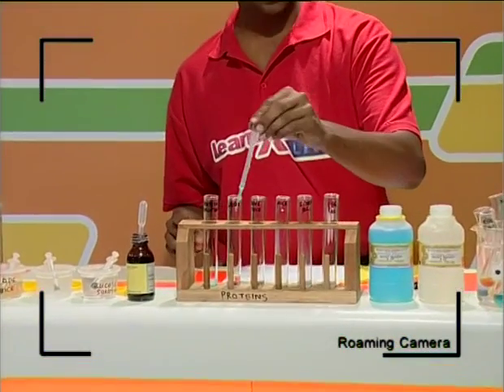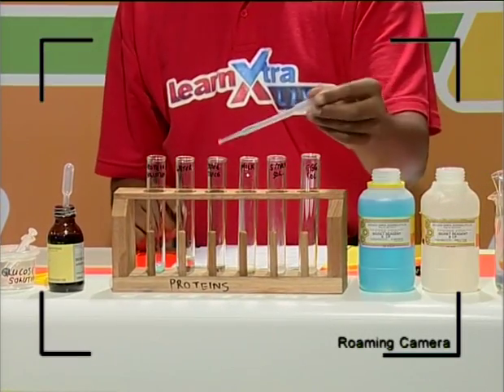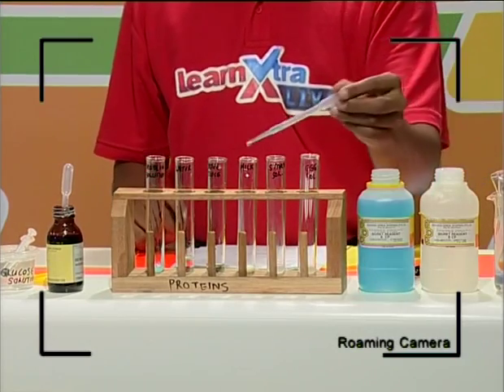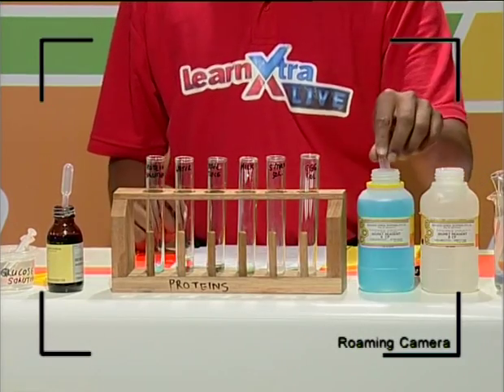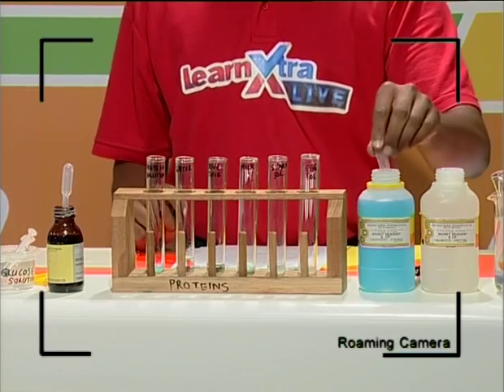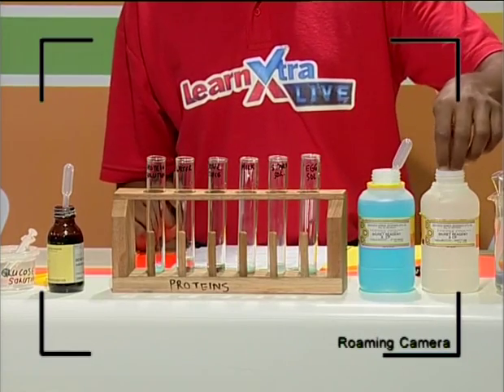And while this happens, guys, I want you to focus on these as well. Why do I do the additions and dilutions in here? And you'd notice that the glucose test is giving us some positive results already, and some beautiful colors and differences. So we've got to interpret those after we put this to react for a little while.